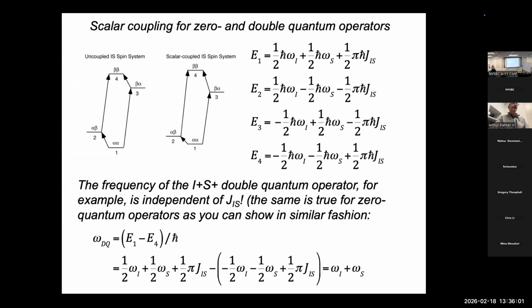So you can adjust the delays so that you evolve the weak couplings, but the strong ones will refocus. It is possible to adjust the two delays, more or less by accident, so that multiples of one are equal to the other.